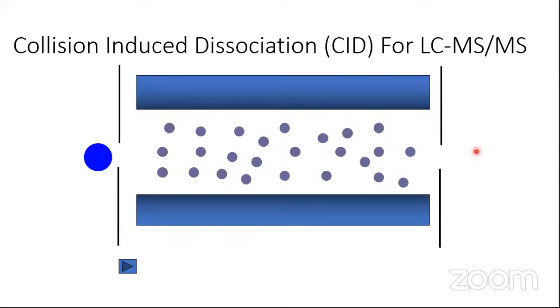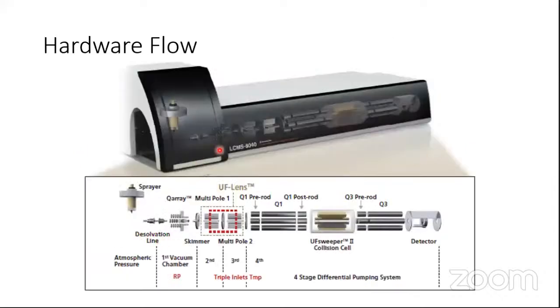Okay. So we have a device like this. So this is the hardware of LCMS. I mean, you have the ionization source, say electrospray.